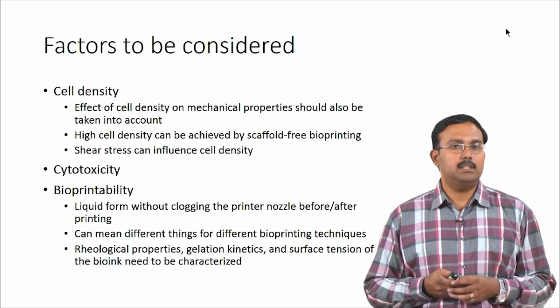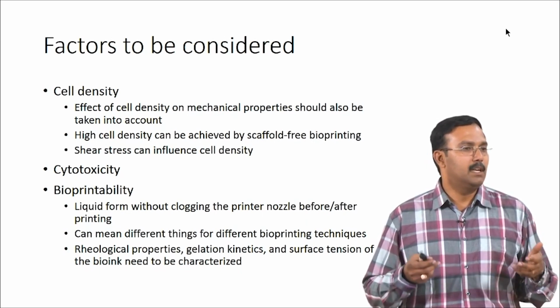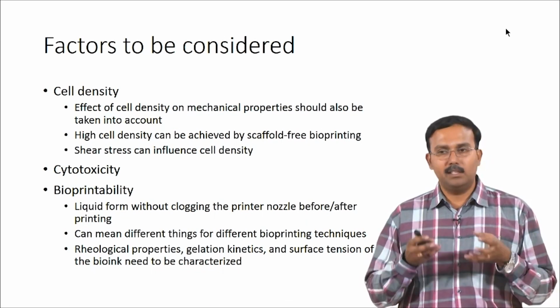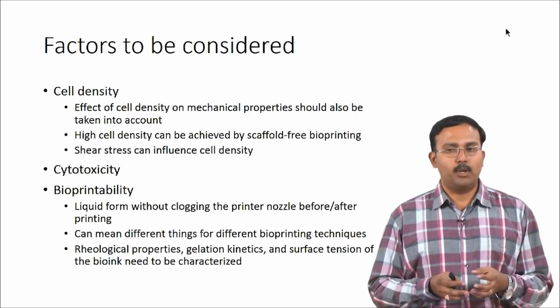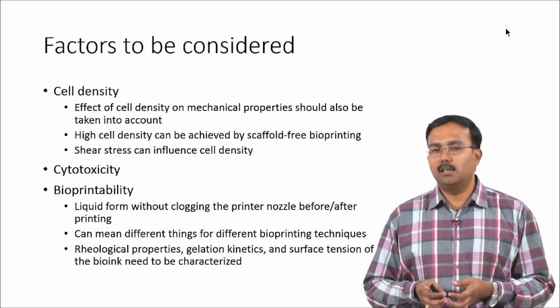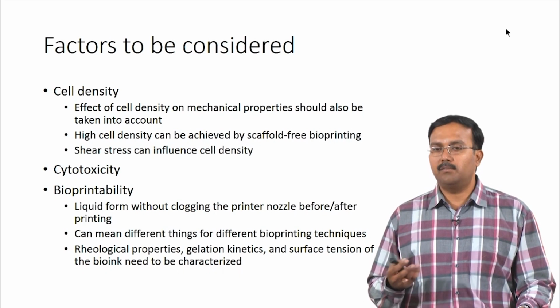Cytotoxicity of the ink has to be taken into consideration. Obviously, it is not just the polymer you are using; you might have a solvent, you might have other additives which are present along with the polymer. You would have to take all of that into account while you are printing. So the cytotoxicity of all the components has to be looked at.